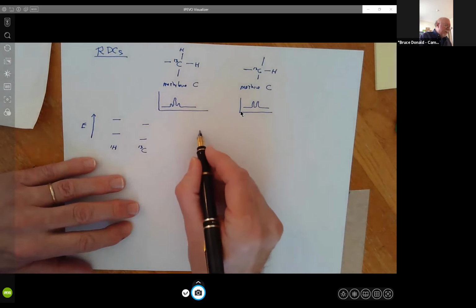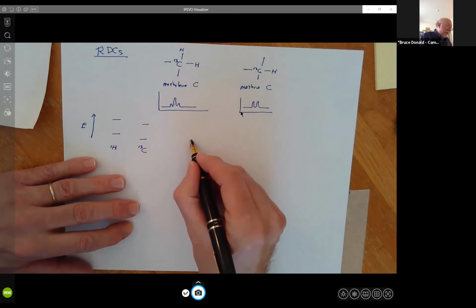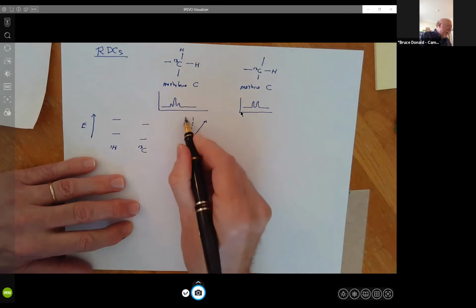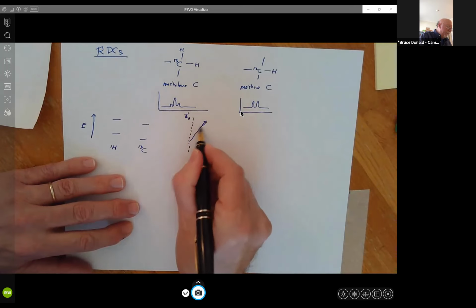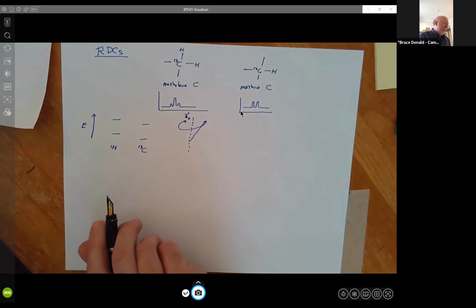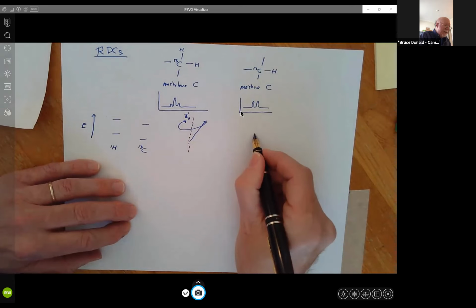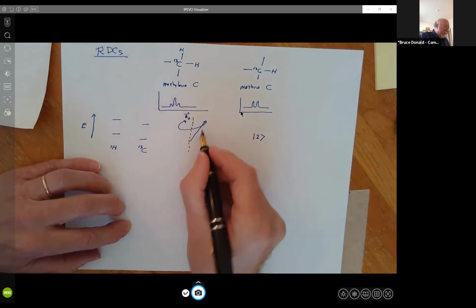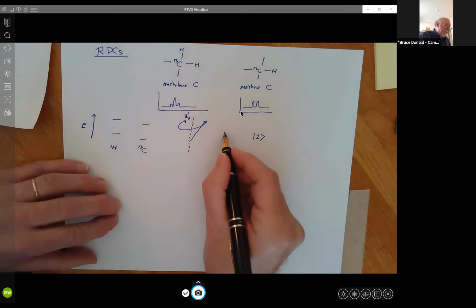Now, what are these things exactly? Of course, this corresponds to a fairly complex object. In the up state, we're talking about a spin that's going to precess around the magnetic axis here, say precess in this direction, rotating around like that. That's the up spin. In quantum mechanics, you might have seen this represented by this kind of notation, a bracket and 1. The down spin has this vector exactly opposite, pointing down instead, and that would be the 0 state in some sense.